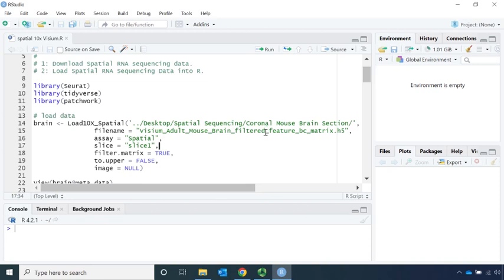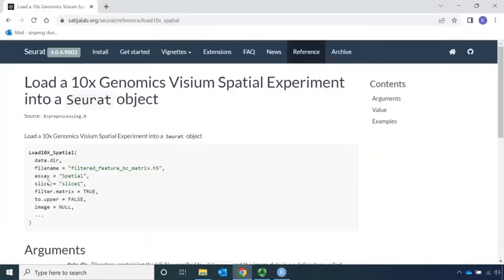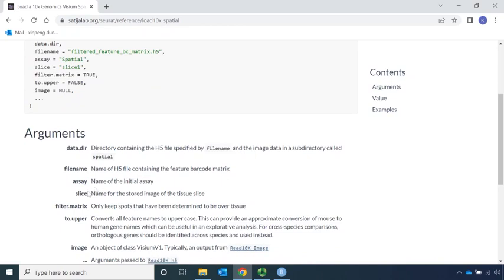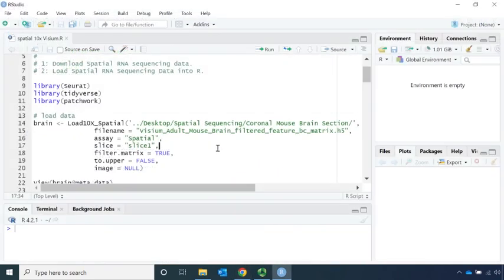After the file name, it is the assay name. The assay name names the initial assay — we know it is spatial sequencing data. Then the slice: the slice name for the stored image or tissue slice. Now we can run this function.